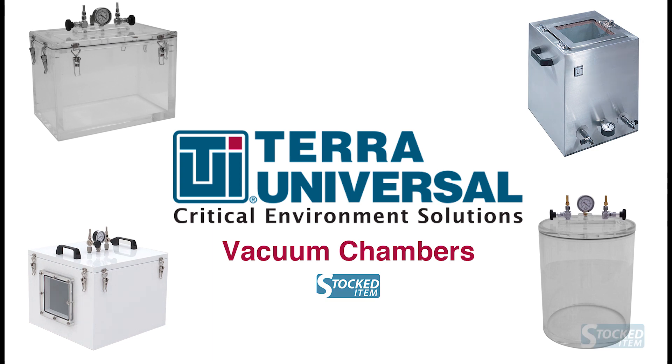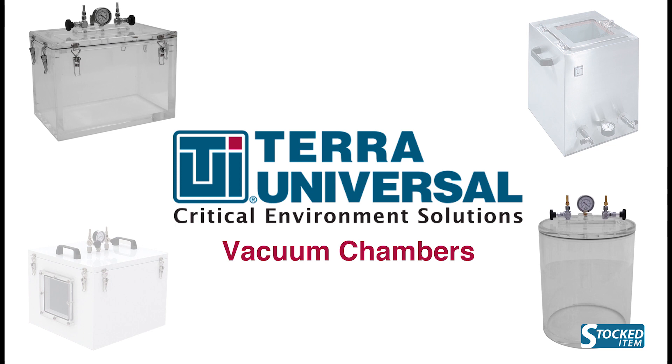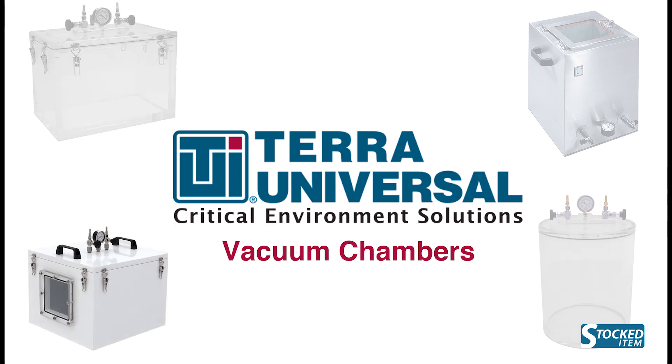Chambers have three material options: acrylic, powder-coated aluminum, and stainless steel.